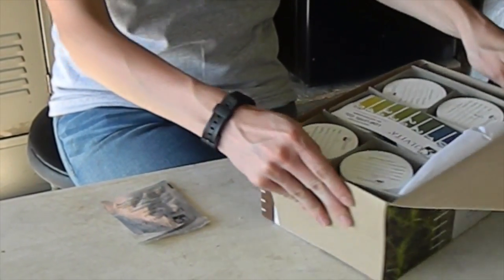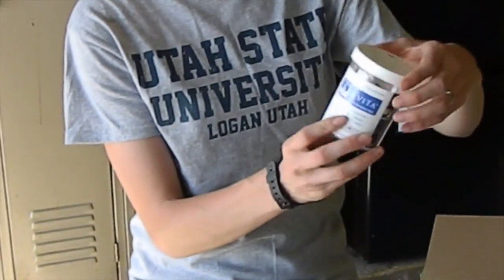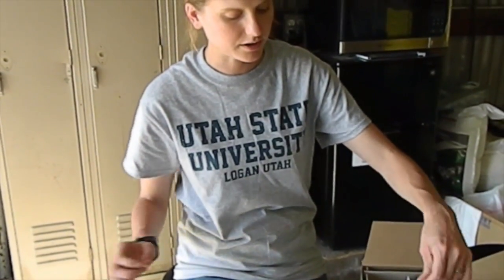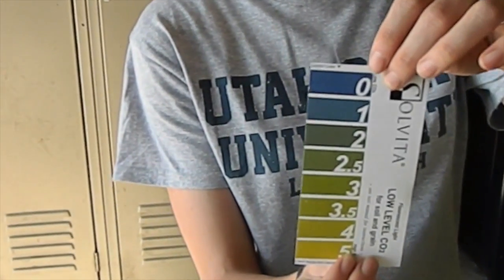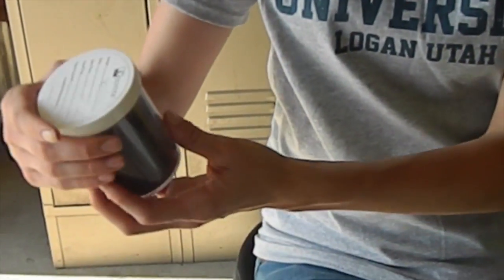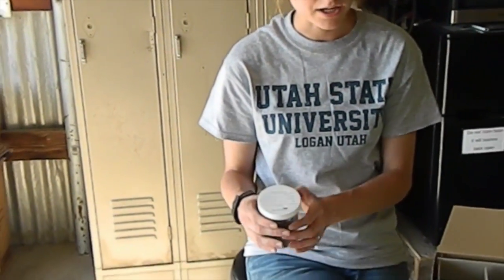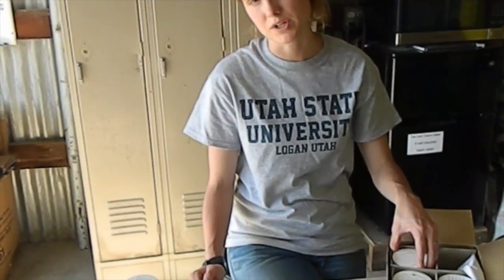We'll quickly look at this. These are the little cups — they've been previously done so you can get an idea — and these are the indicators. Solvita measures CO2, which is a measurement of how much respiration is going on in your soil. It can be a really good indicator of soil microbial life, which is really important in terms of nutrient turnover.